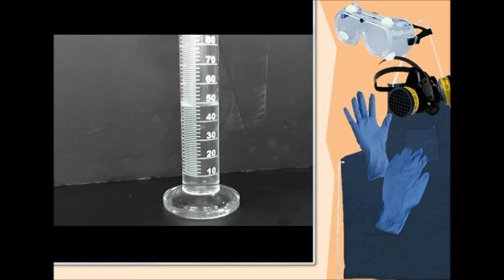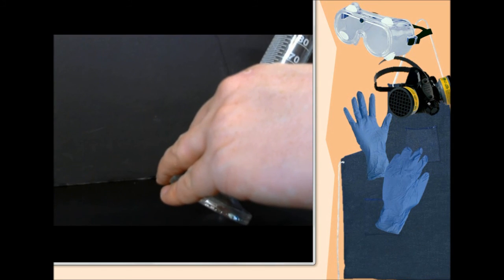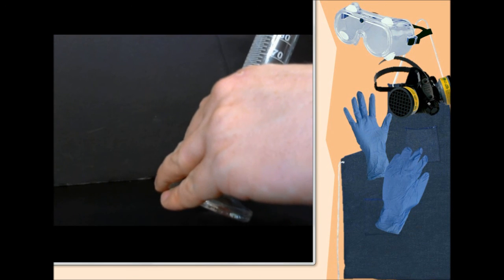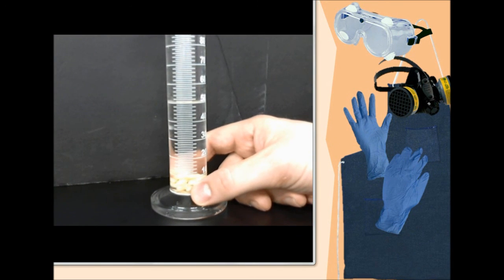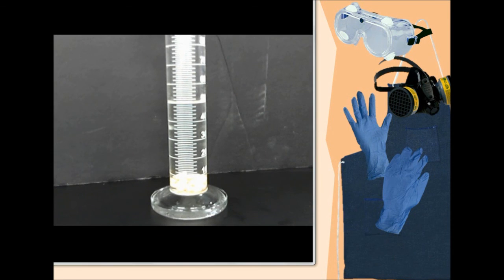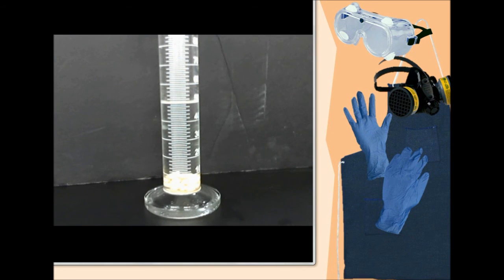The next step is to take my popcorn kernels, and I'm going to add them to the graduated cylinder. The best way to add things is to tip the graduated cylinder diagonal and just slide the things that you're adding gently down the side so they don't make too much of a splash as they enter. So I've added my popcorn kernels, and we went from 49.3 to, as I read this scale very, very closely, from the very bottom of the meniscus, this is exactly 50.0, exactly 50.0 milliliters. The bottom of that meniscus is just barely kissing the 50 line.